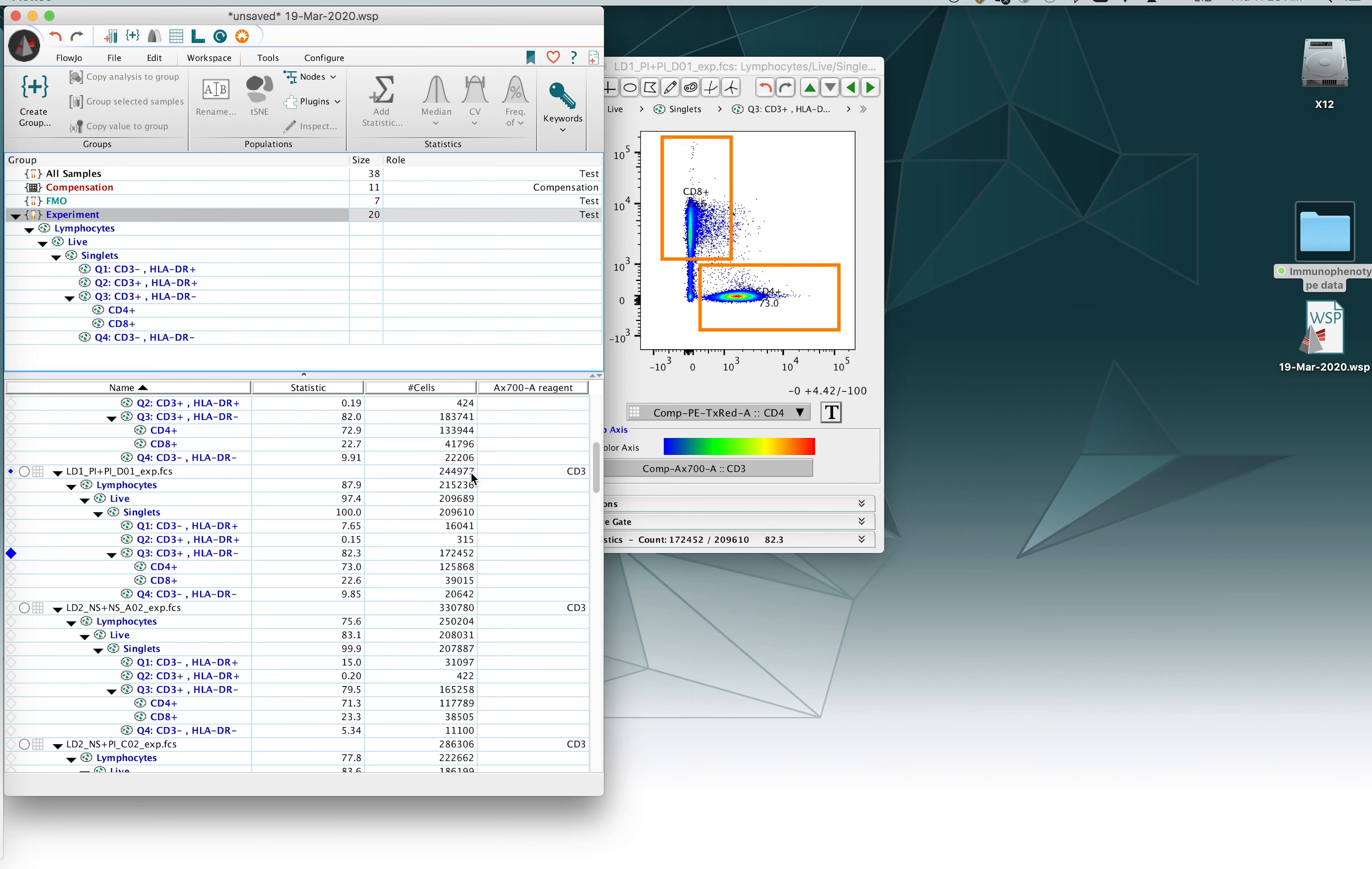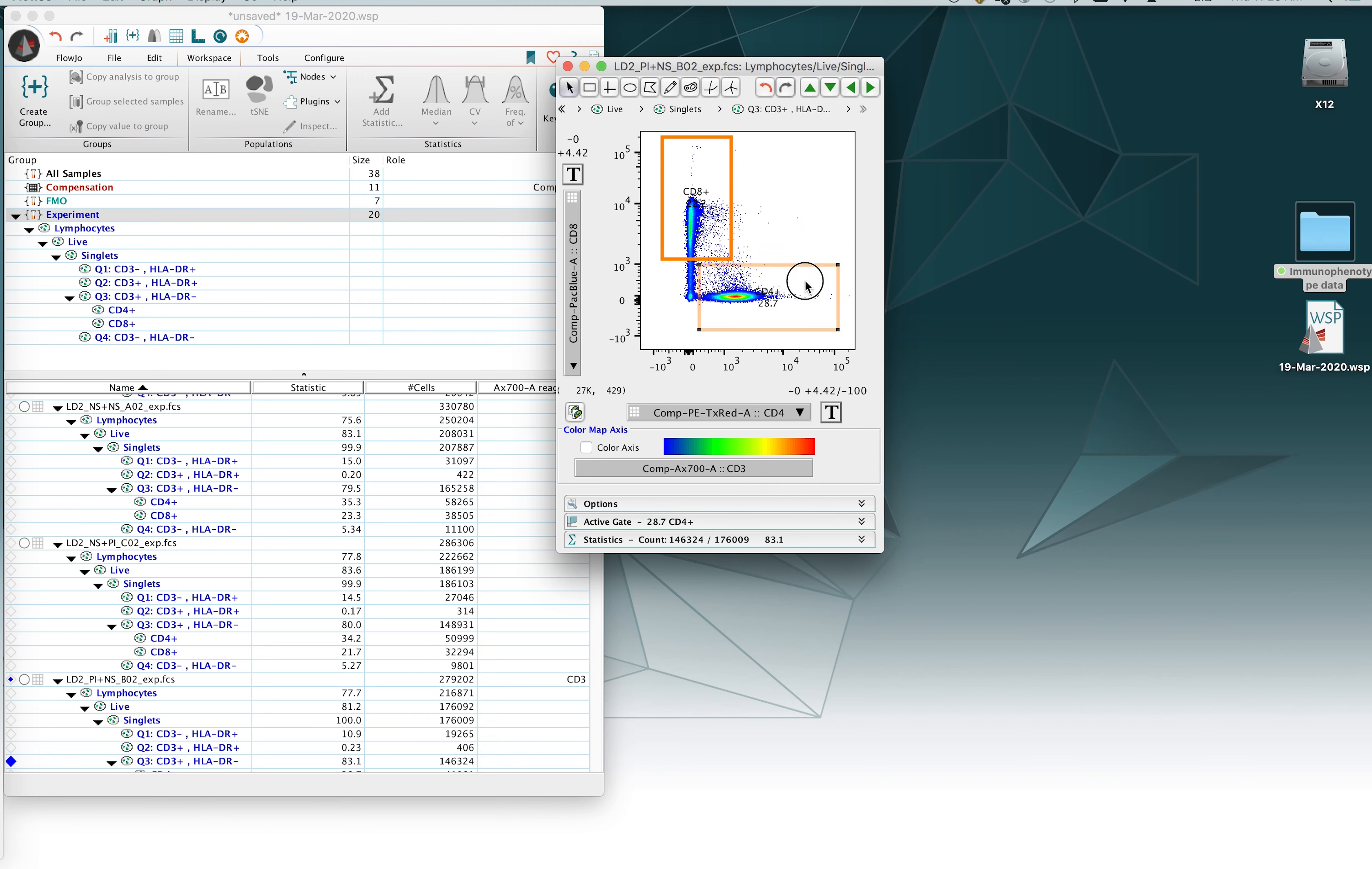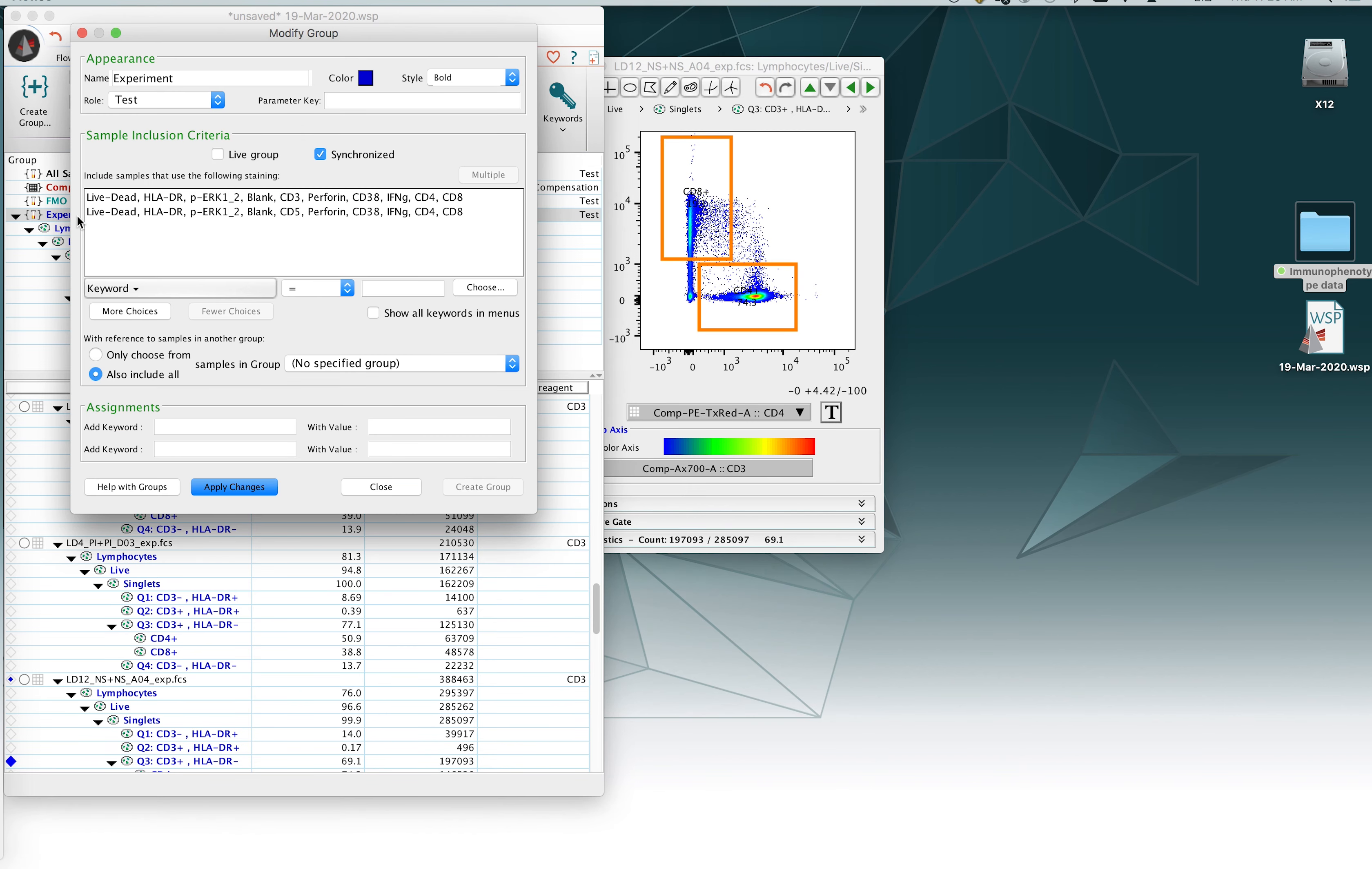Close the window and now when you go about moving your CD4 gate, this will automatically be updated across all other samples. Same thing if you reshape the gate, all other samples will automatically update. So it's entirely up to you if you'd like to use that function or just simply use the copy analysis to group every time you make a change to a gate.